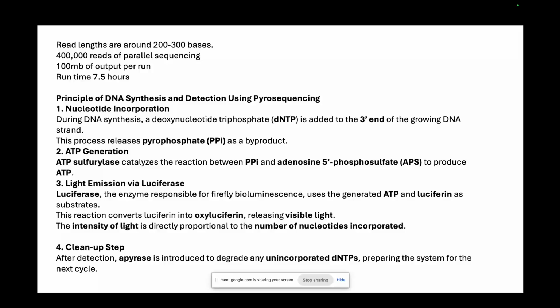Depending on that, an insertion or deletion will be incorporated, but that will be a spurious variant, because that variant does not exist. You are only finding it because the sequencer has not counted the number of repeats of the same nucleotide perfectly. It has either underestimated or overestimated, so you get an indel around that region. This is an issue we still face even with modern third generation sequencing technologies, but you can also see this issue in pyrosequencing.